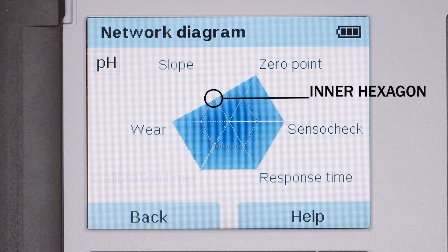When a value enters the inner hexagon, the corresponding text flashes red and the sensor should be attended to. The situation may be remedied by cleaning and calibrating the sensor, or the sensor may need to be replaced.